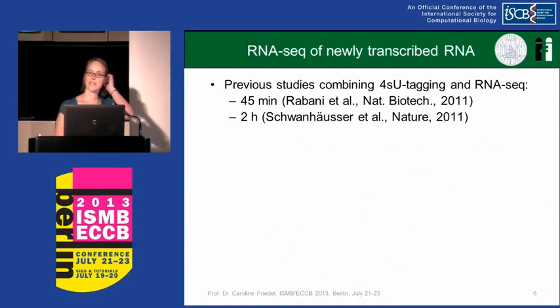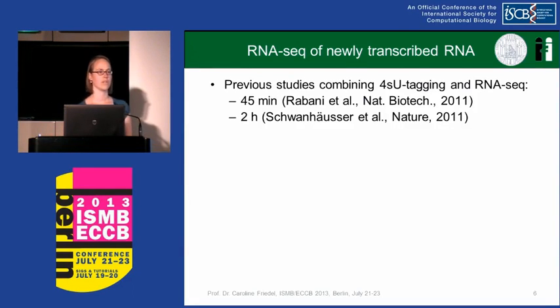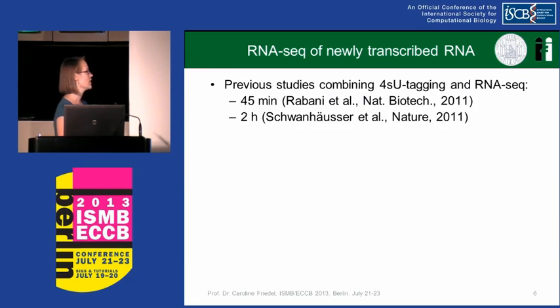Previous studies that combined 4sU tagging and RNA-seq always used relatively long durations of tagging: 45 minutes, which I think was the first study to do this, and a later study used 2 hours. As we will see later, at this point most of the newly transcribed RNAs are already spliced, so you can't really look at splicing or processing.